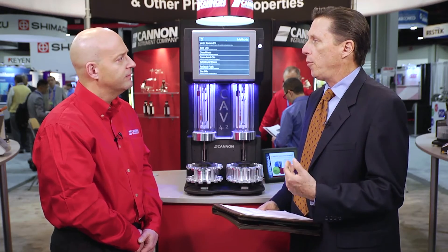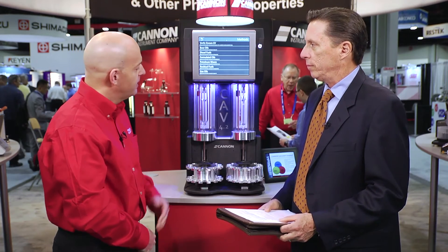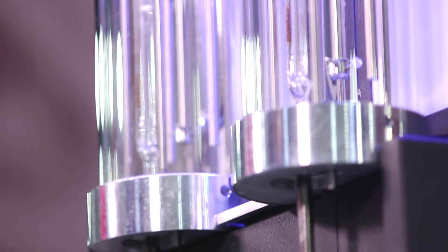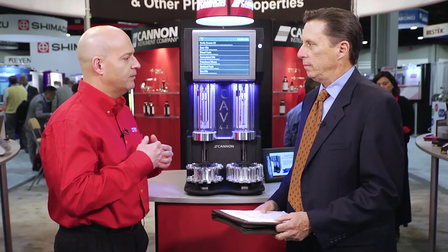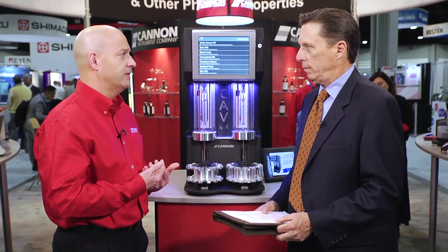Does the system itself help with solvent usage? It does. Because of the small capillary size in this viscometer, we use roughly a quarter of the solvent that was required on our previous generation systems. The solvent usage would directly translate into savings for the lab from an operation standpoint, not only on the consumption, but on the disposal side.